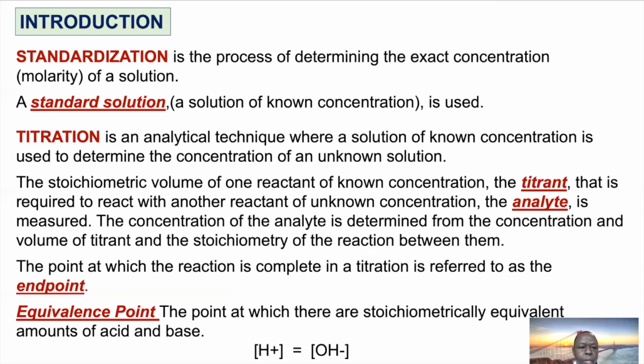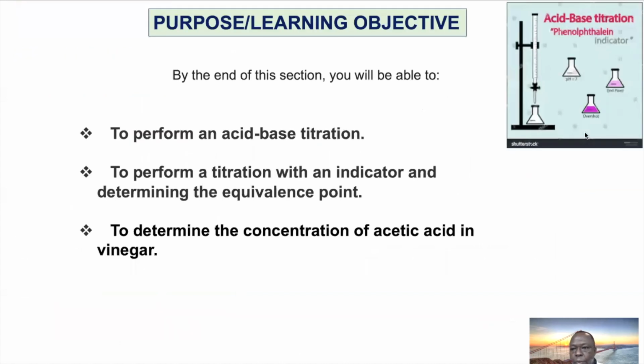I'll get to that. How will you know that it's time to stop addition of the standard solution? By paying attention to the endpoint. Endpoint is an estimate of the equivalence point. Endpoint is a point in titration where you need to stop addition of the titrant into your analyte, and it is signified by a change in color. When you see this endpoint, we know that it is time to stop.